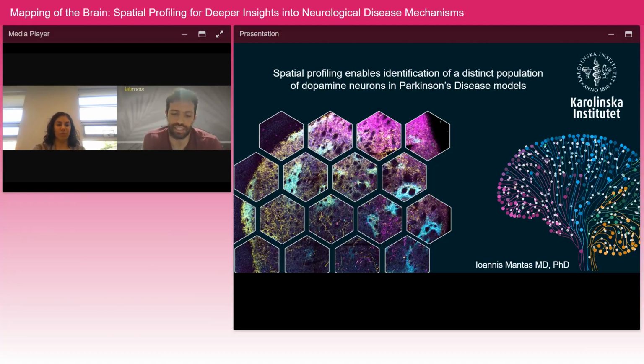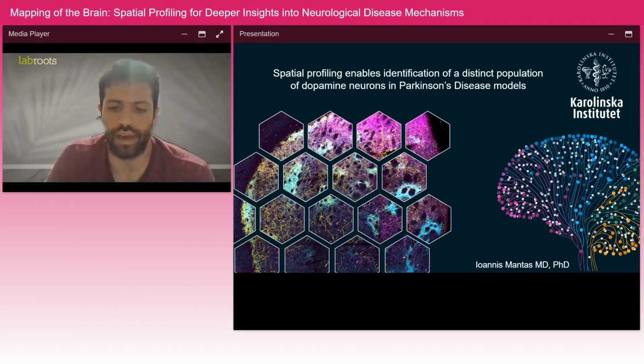So as Sydney said, I'm a postdoc right now at Karolinska Institute. And I'm going to present to you, as the title says, spatial profiling of dopamine neurons related to Parkinson's disease. Just to give you a brief overview of what I'm going to show you, first of all, I'll try to convince you why MERFISH is important to do that in research of Parkinson's disease, and why it's important to identify dopamine neuron subtypes.